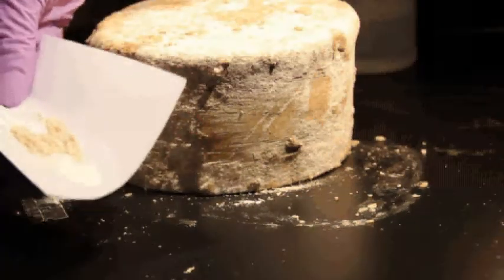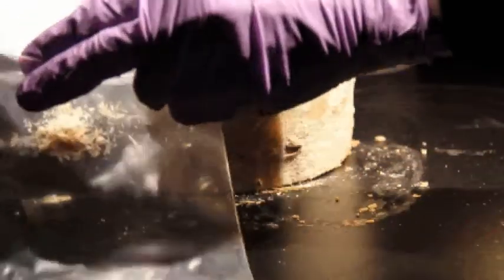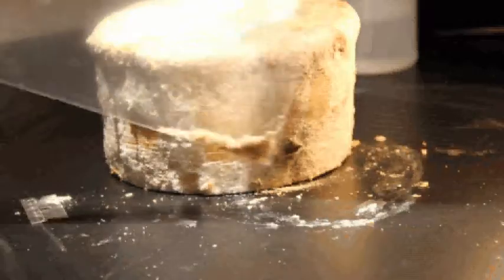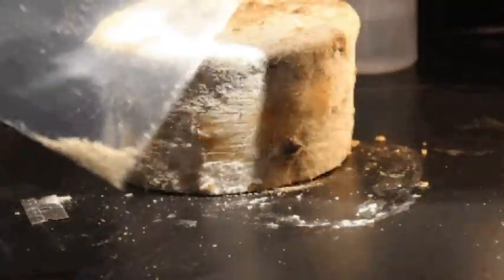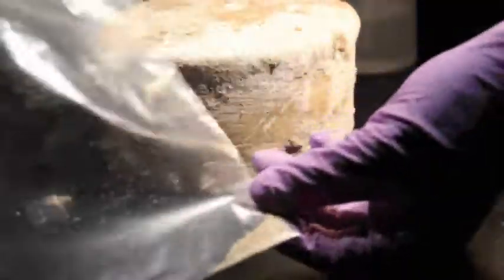Now I'm going to take that sample on the piece of paper and dump it into the plastic bag. If it's a natural rind cheese, it'll probably be pretty dry. Try to collect it into one corner of the bag so it's not dispersed throughout. This is actually a little bit low in terms of the amount of sample, so I'm going to scrape a little bit more to make sure we have enough.